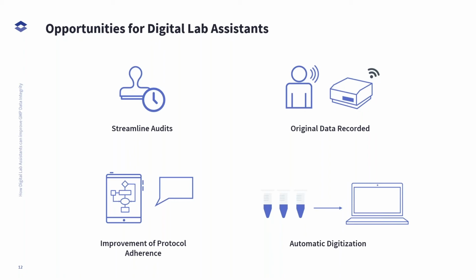As we know from our ALCOA principles, data is required to be contemporaneous, meaning the recording of each activity is required at the same time that it actually takes place. As you can imagine, documenting activities performed during manufacturing within a BSC actually could be very challenging.